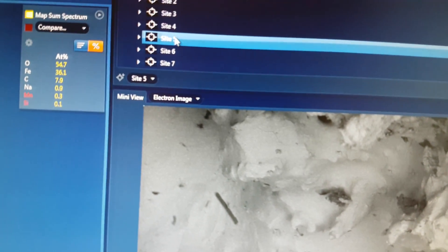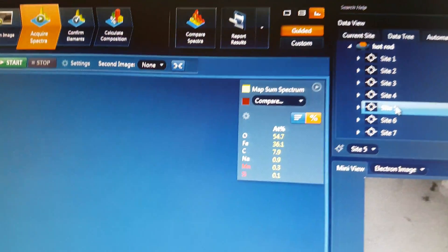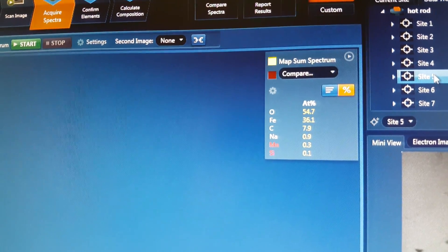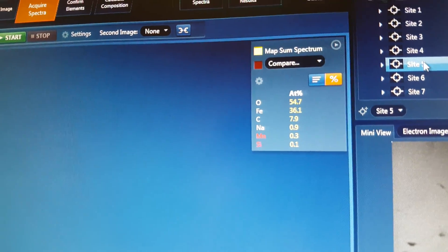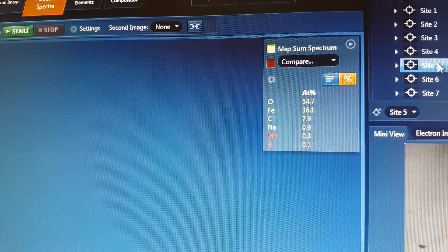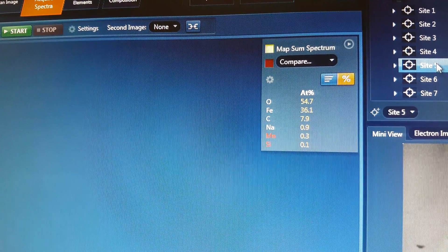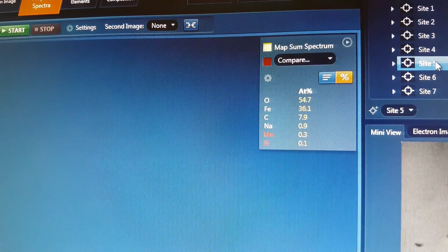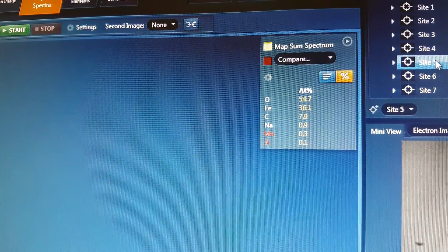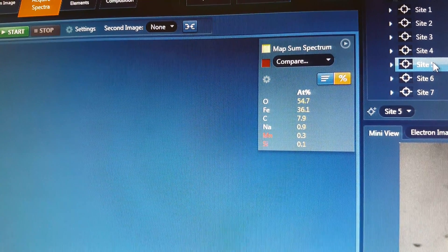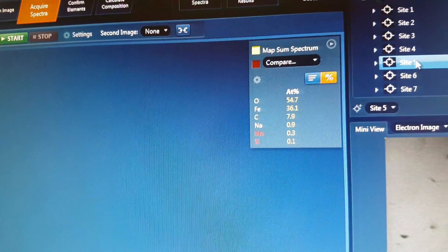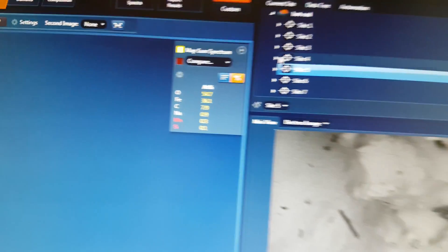So then look at this area and you see it's a bit closer in, really quite glassy in structure. And again we're seeing the same sodium bicarbonate type of signature with the iron oxide.